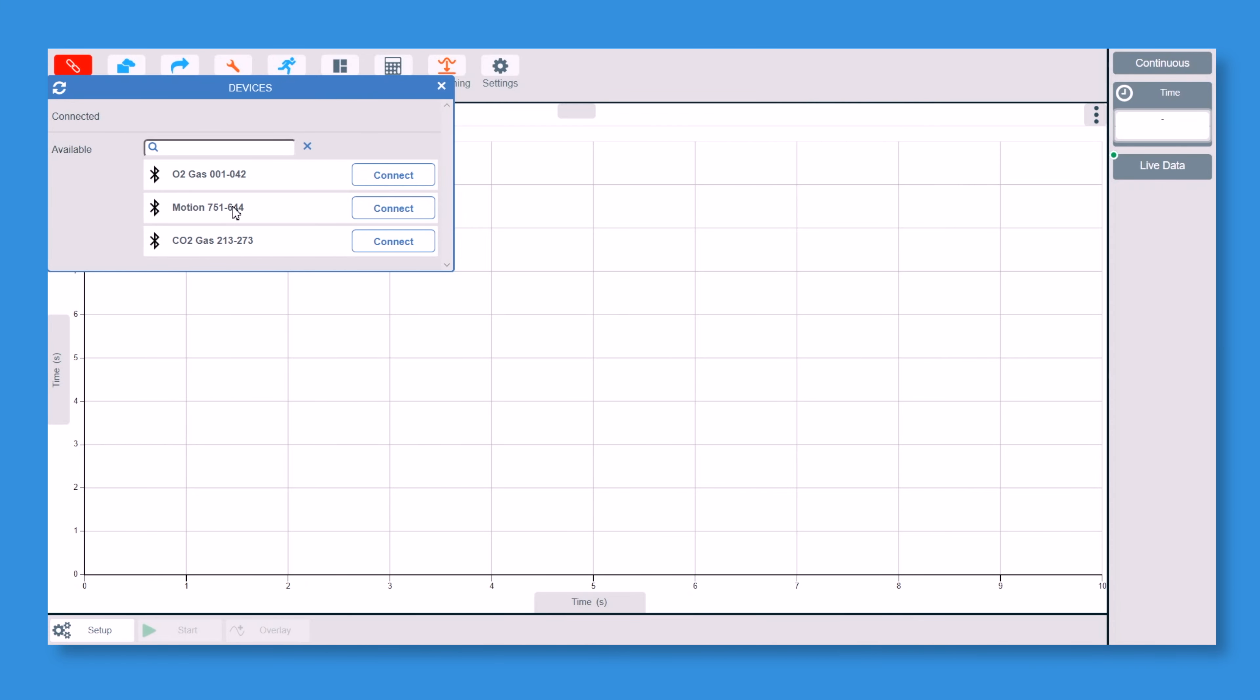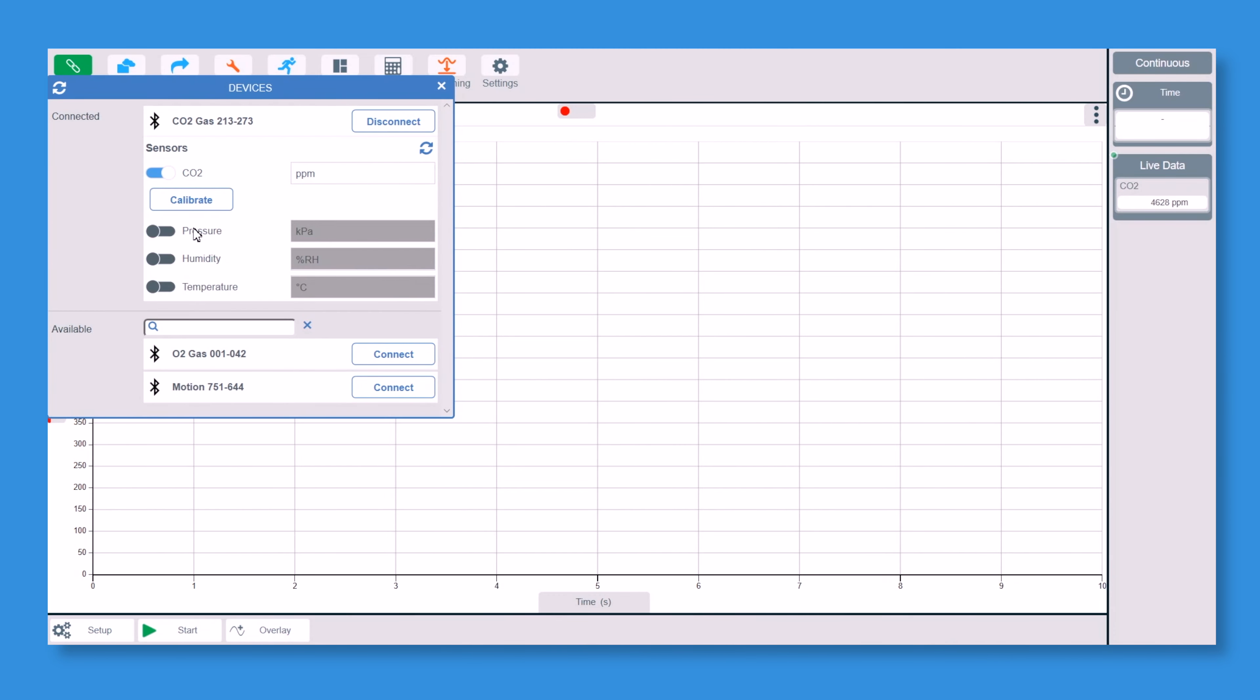Someone else in the building is using motion at the moment, but we don't want to connect to that one. So we're going to connect to the CO2. It just takes a second or two to connect and then we will connect to the O2.